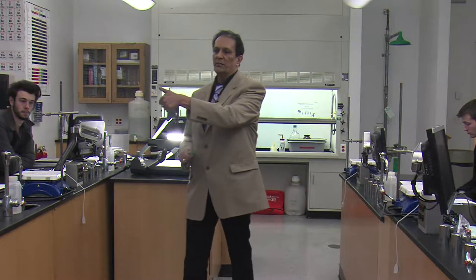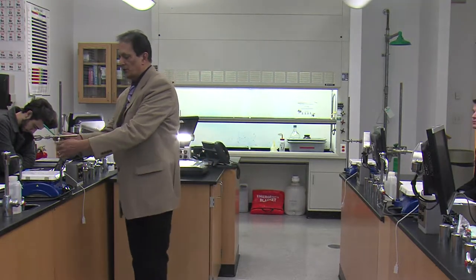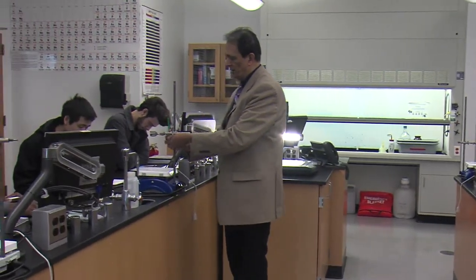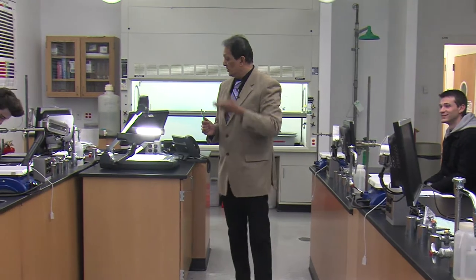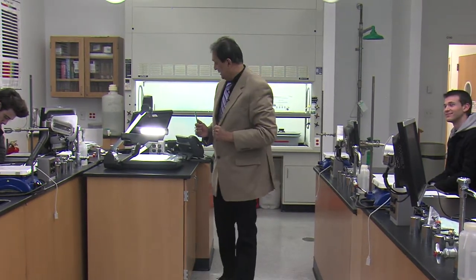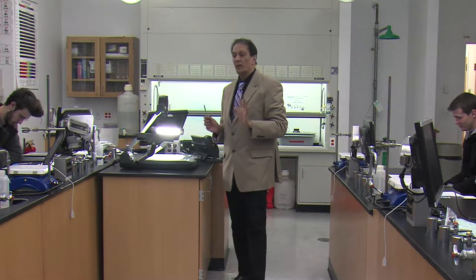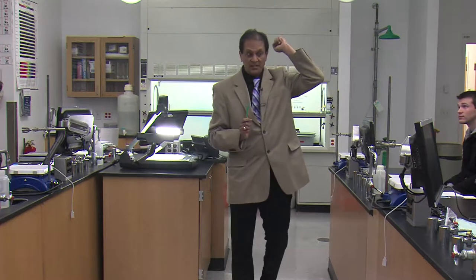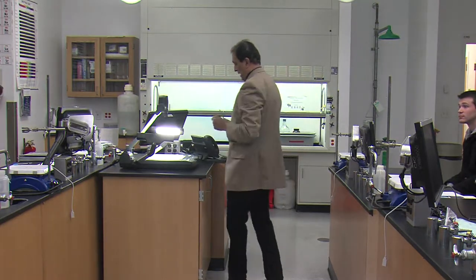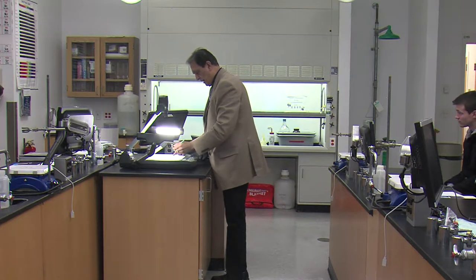Number 13, long hair should be tied back, all right? Once again, we'll be lighting Bunsen burners, we'll be using these heaters and so on. If you start having a warm, fuzzy feeling over here, that means your hair is on fire. Okay, so make sure that you tie your long hair back. Okay, and bring your own rubber bands and ponytail holders and so on. I don't have any extras over here. If you are wearing a hat, make sure the hat is turned around, all right? Otherwise, your rim will catch fire when you are performing an experiment.